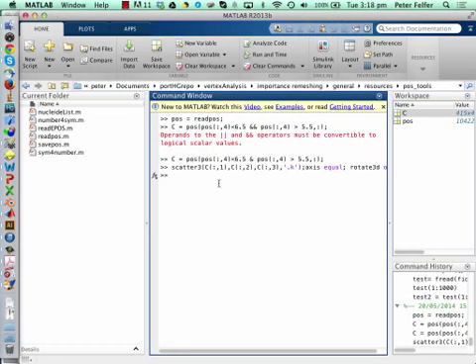Doing that for every single range or every single mass-to-charge window would be ridiculous if you regularly work with atom probe data in Matlab. So I've created Xrange, the Xrange editor, which I think most of you are familiar with. If you're not, you'll find it on my webpage, along with tutorials for it. It does pretty much everything that the usual ranging program in either the commercial software or elsewhere does for you, and it just goes much faster than if you do everything by hand.